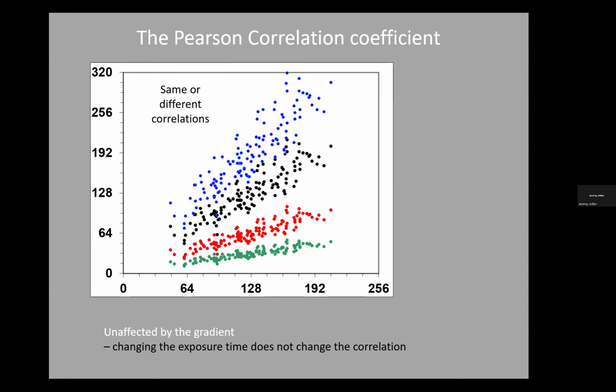I mean, looking at them, you think, nah, they don't. This one has a much shallower angle, this one has a steeper angle. But when measured, they have the same correlation. Mostly because the calculation involves the subtraction of the mean. I mean, they won't have the same angle of regression line, but the correlations are identical. So this is important because otherwise changing the gain or changing the image acquisition time or the excitation intensity for one fluorophore would change the measured correlation. It doesn't.